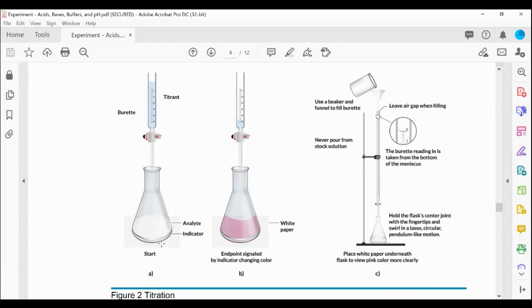But in the titration, we need to measure with a volumetric pipette or volumetric glassware. We need to know exactly the volume of the vinegar that we use for our calculation. So we have to be precise and know exactly the volume. That's something we are going to use in our calculations. How much vinegar I added to that flask in A. So this is how I start.